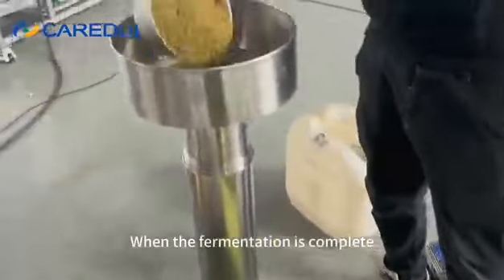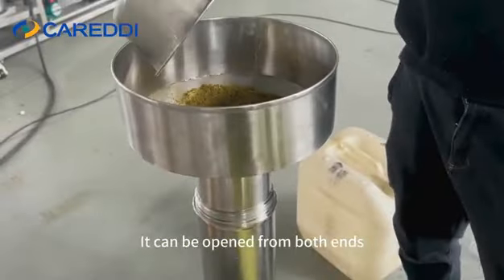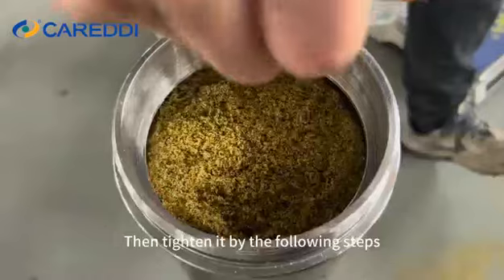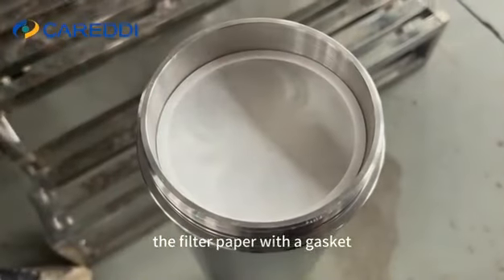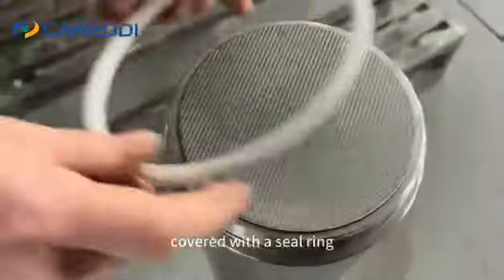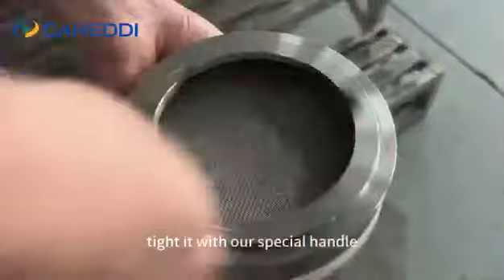When the soaking is complete, we can start loading the material into the extractor. It can be opened from both ends. Brush it clean with no leftovers on the edge, then tighten it by the following steps: first, the filter paper with the gauze; next, the filter plate; then the sintering plate on top, covered with a seal ring; last, screw the lid on and tighten it with our special handle.